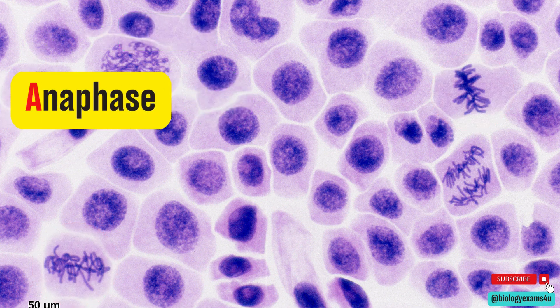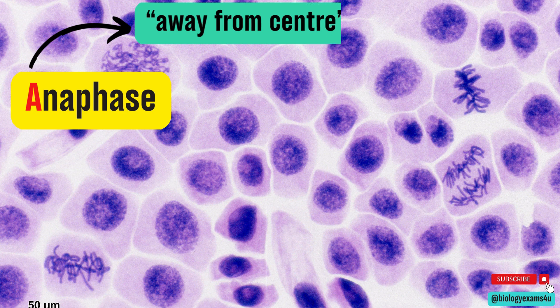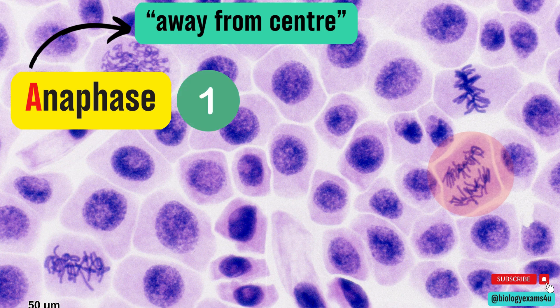Now let us find out the next easy stage, that is anaphase. Just remember A for away from center. Now find out cells with chromosomal strands moving towards the poles of the cell. Here you can see in this cell the chromosomes are moving towards the poles. So there is only one cell at anaphase.